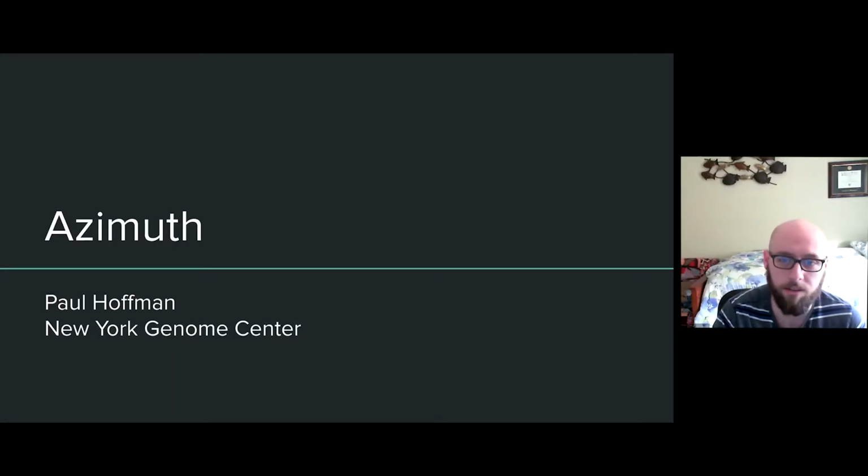Yeah. Hi, everyone. My name is Paul Hoffman. I'm a bioinformatician with Rahul Satija at the New York Genome Center. I'm a developer of the Seurat R package, and today I'll be talking to you all about a new tool we recently released called Azimuth.